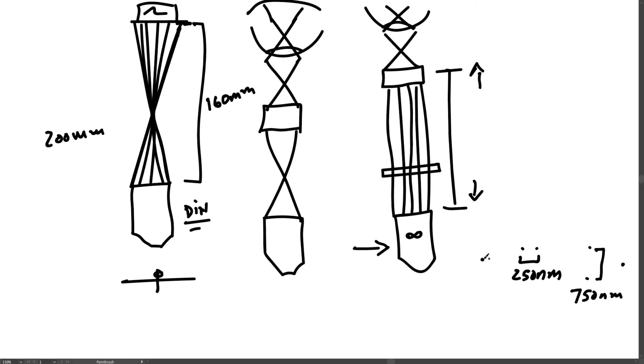It doesn't do you any good to make a higher powered microscope objective, because if you magnify these two objects to a higher magnification, or these two to a higher magnification, they still always look like a single object. So if you're using a 100x objective, you would see a single dot.